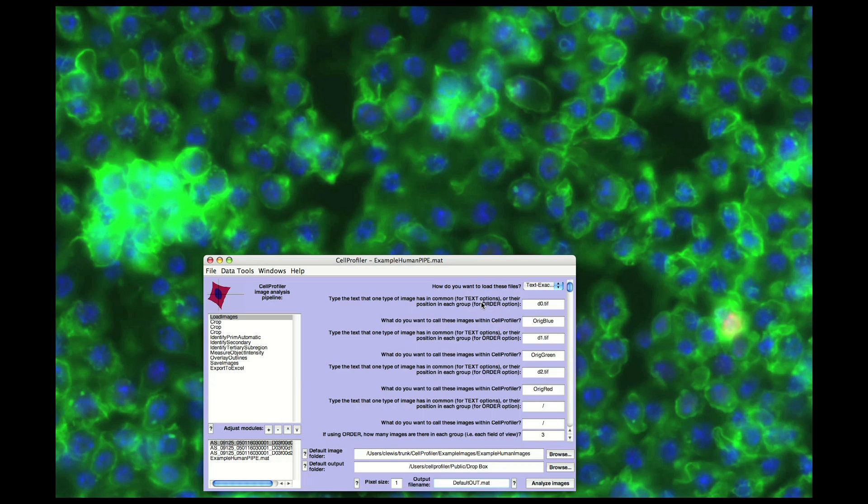For this demo, I will be using a set of human cell data. One of the strengths of Cell Profiler is its flexible modular design and its point-and-click interface, which makes setting up an analysis feasible for non-programmers.